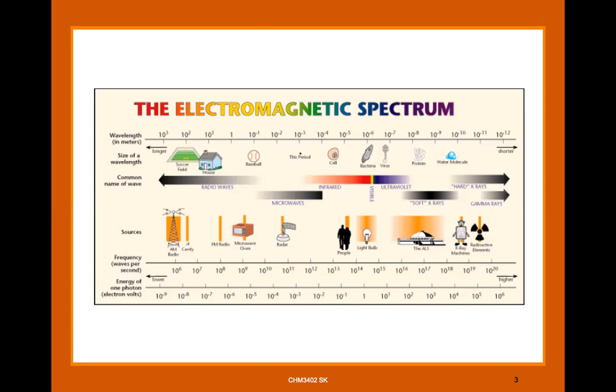So we know already that in order for certain chemical compounds to absorb ultraviolet as well as visible, especially organic compounds, they require a certain structure. So if it is an organic compound, it requires the chemical compound to have a double bond, or we call it a chromophore.